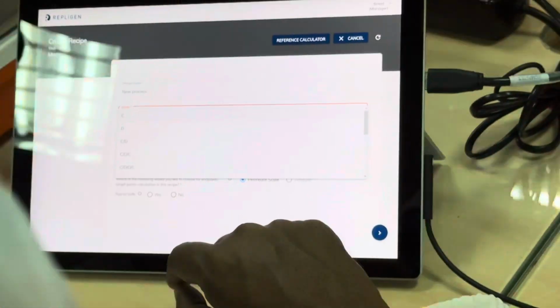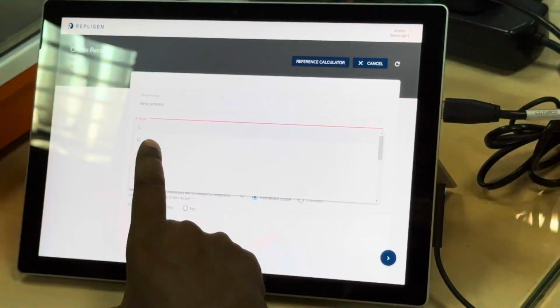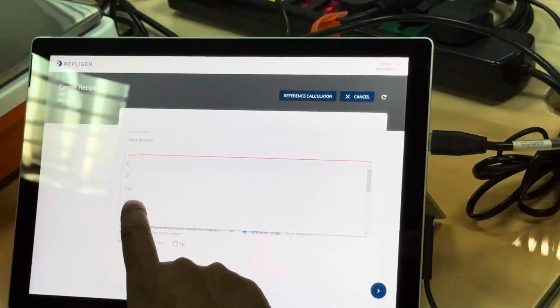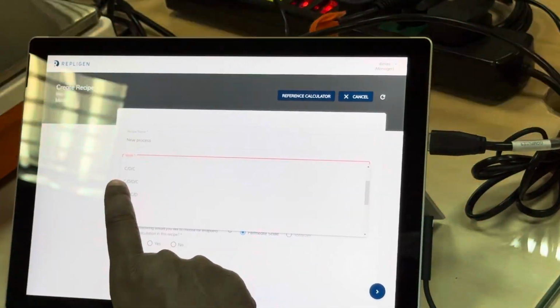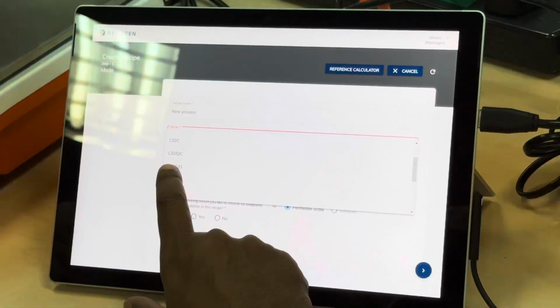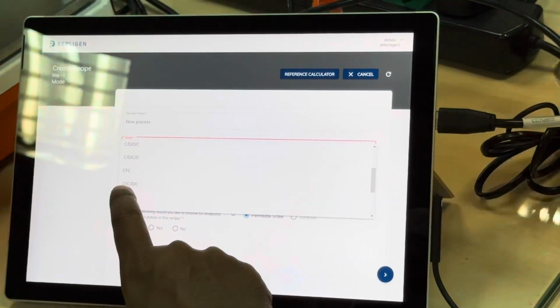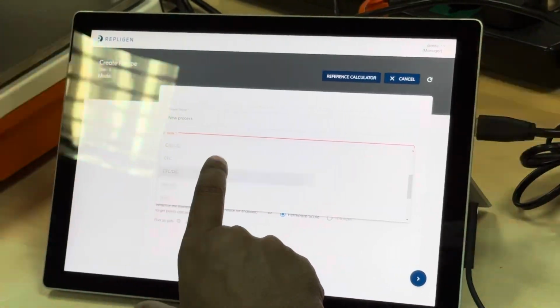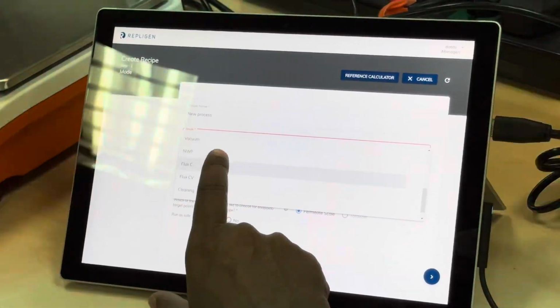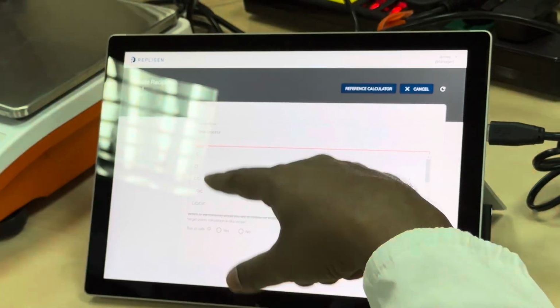So you can see here the big list of modes, like concentration mode, only diafiltration, no concentration, concentration diafiltration, diafiltration followed by concentration, concentration diafiltration 1, diafiltration 2, and concentration, continuous feed concentration, continuous feed concentration diafiltration and concentration, and vacuum is something manual, and NWP, flux C, flux CV, cleaning, flushing. So there are many modes you can choose.